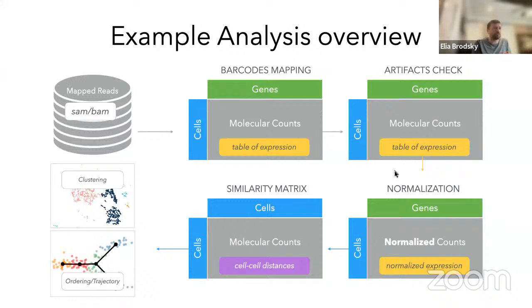Once we have sufficient data for those specific cells, once we have a sufficient matrix, we want to check for artifacts, right? And those artifacts are going to help us prepare a better table of expression. That table of expression will have as many cells as possible filled with numbers and not zeros, and that's a major challenge dependent on these factors of data preparation.